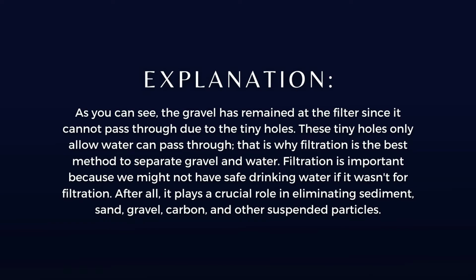As you can see, the gravel has remained at the filter since it cannot pass through the tiny holes. These tiny holes only allow water to pass through. That is why filtration is the best method to separate gravel and water.